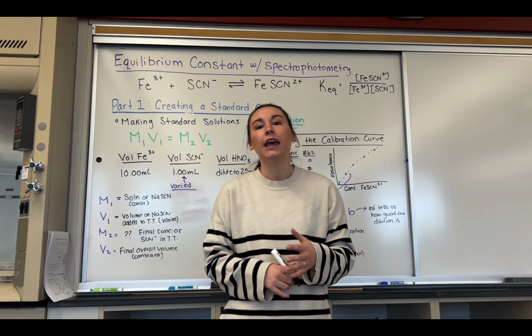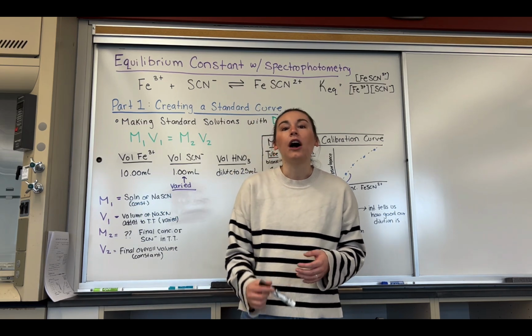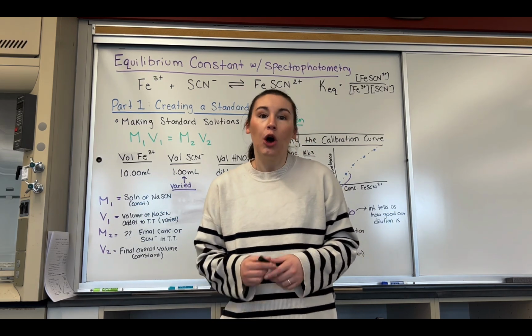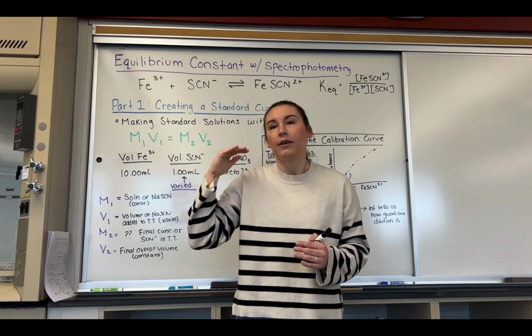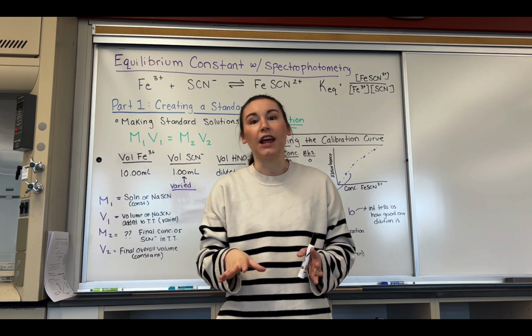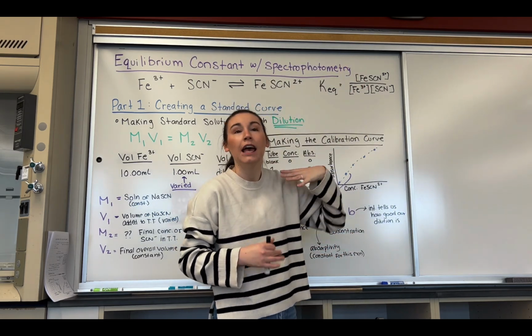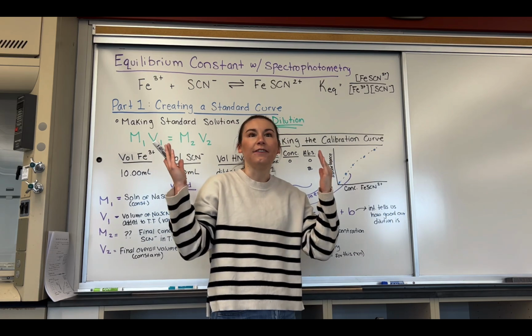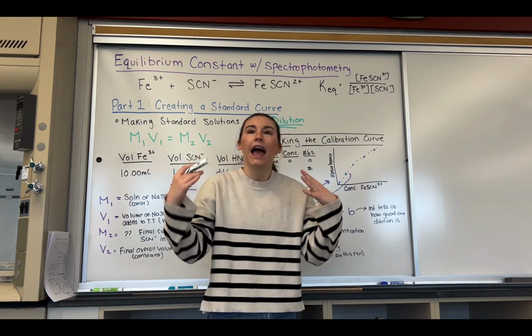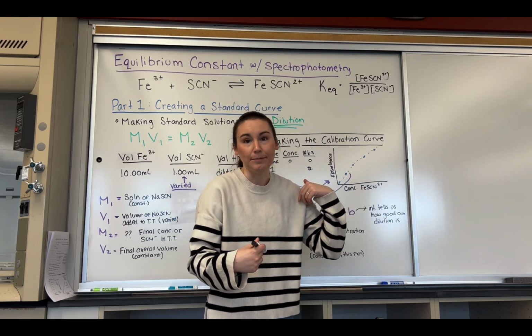It's just going to shift our equilibrium one way or another, but the concentrations are going to change to account for that. K can only change when we change our temperature, which is what we saw in our entropy of borax lab, where we took equilibrium calculations for each different temperature. So this one, we are now exploring how to find K when we change our concentration. Essentially, we're going to find 5 different values of K and average them together to get an overall K for this reaction.